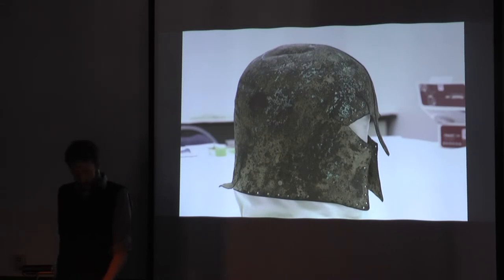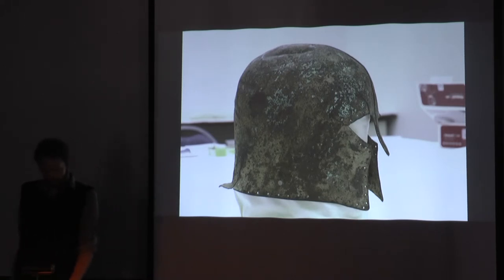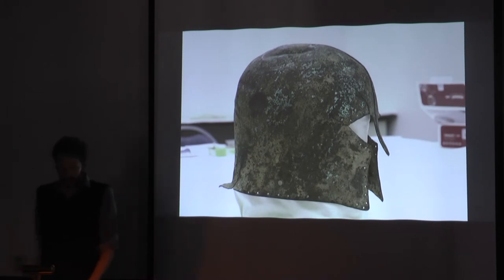Object 8-4597 was obviously cleaned at some point, and we can now see the clean bronze over much of the object. 100 years ago, some conservationists would cover freshly cleaned copper objects with a zinc-based chemical, or a lacquer, in order to keep it from corroding after it was cleaned. It is clear from our study that object 8-4597 was not chemically treated. We never detected more than just a trace amount of zinc, and there were no wildly unexpected elements. The cleaning actually turned out to be a huge benefit to our study because it allows us to get a more accurate measurement directly onto that shiny bronze surface.